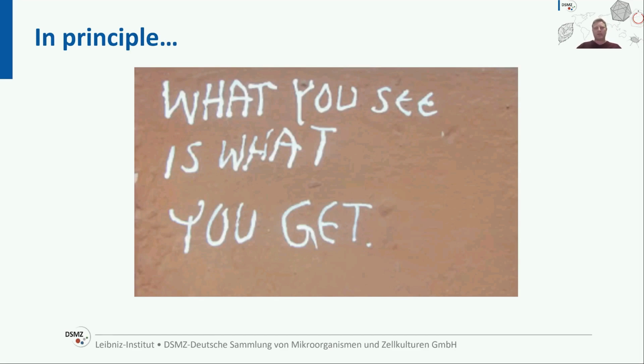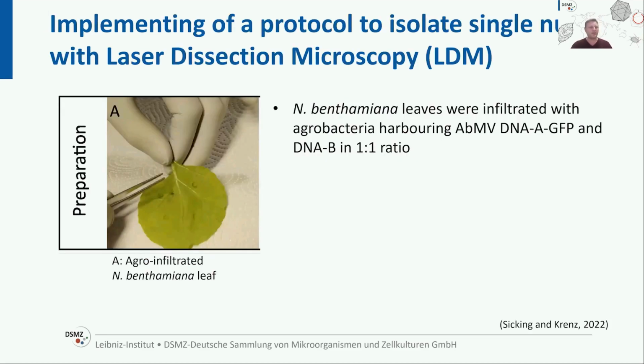When we are looking at tissue samples at the molecular level, we sometimes run into problems caused by fixatives like formalin. These chemicals create crosslinks that make it tough to copy DNA or RNA. Science is always moving forward, and now we've got new ways to pull out and amplify genetic material from this tissue. Nevertheless, Christoph Sicking, our PhD student, now wants to present you a method which has been developed to avoid fixation. And that's why we now switch to Christoph.